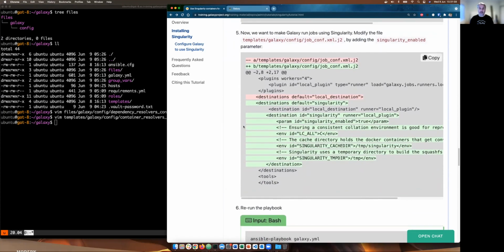So next, what we want to do is we want to edit our job.conf file. And remember from the previous tutorial, the job.conf file is very important. It's the file that tells Galaxy where to run jobs or how to configure its job handling. So we ask Galaxy to run a tool for us. So we load the tool form into our web page, we fill it in, we press the little blue execute button, and then Galaxy says, okay, someone's just asked me to run a tool.